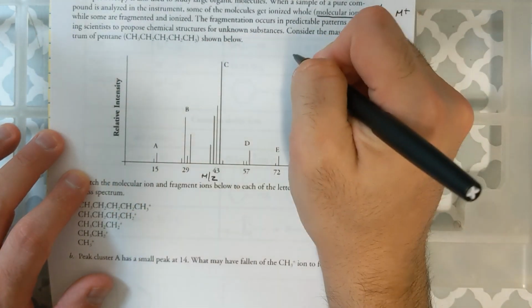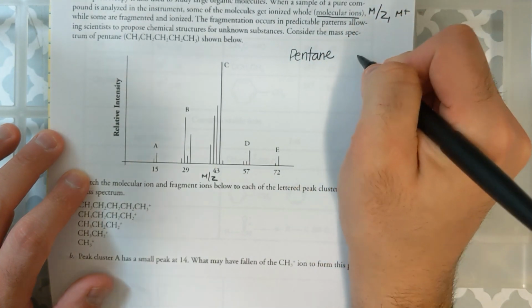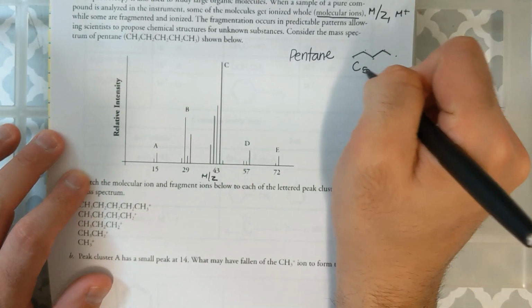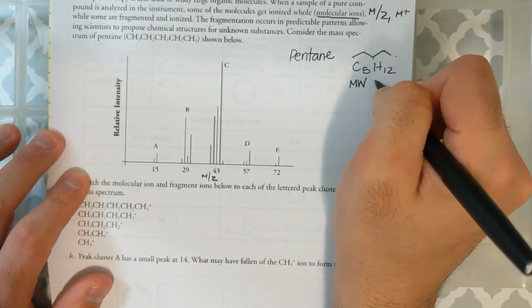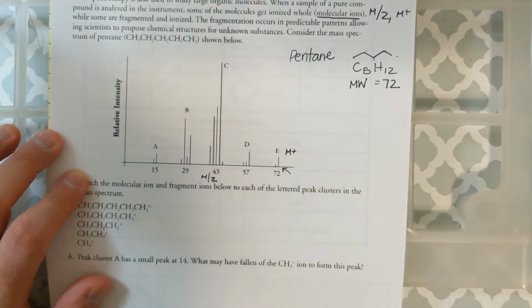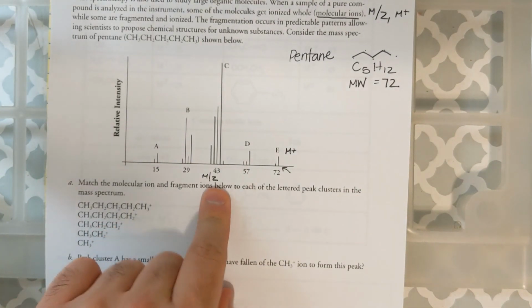All right, so keep in mind these masses and the differences between these masses. So let's talk about pentane for a moment, and we know how to draw pentane. Pentane looks like this. 1, 2, 3, 4, 5. It's C5H12, and it has a molecular weight of 72. So this is technically right here the M plus peak. That's the whole pentane, but it must be positively charged.